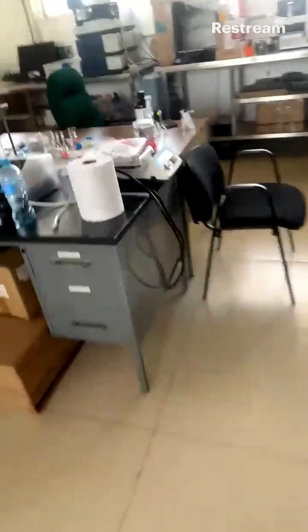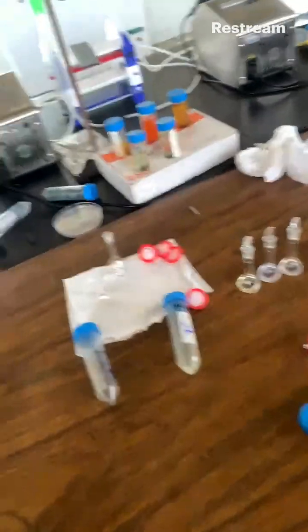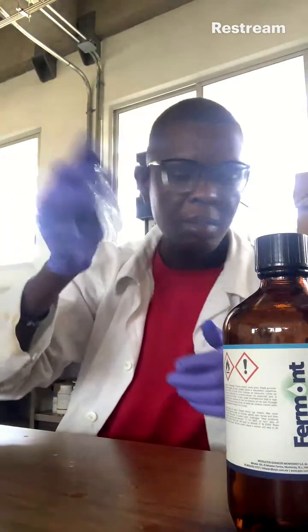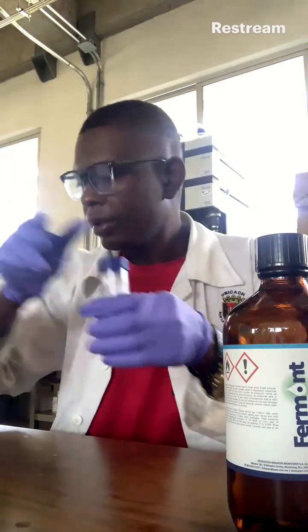So guys, I made a mistake. I need to prepare my standard. All right, I need to prepare a standard. I did not prepare my standard.